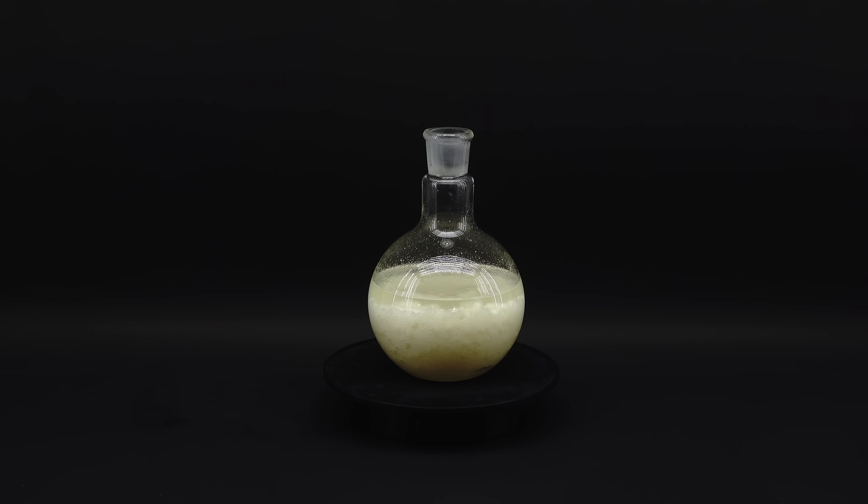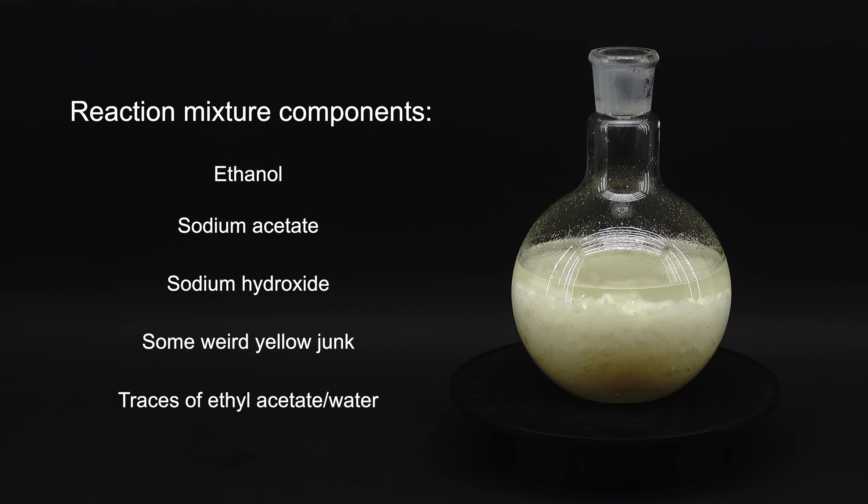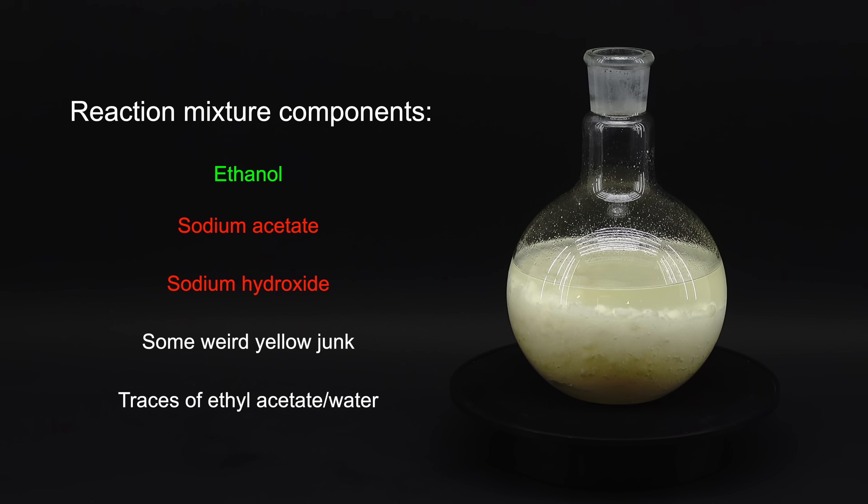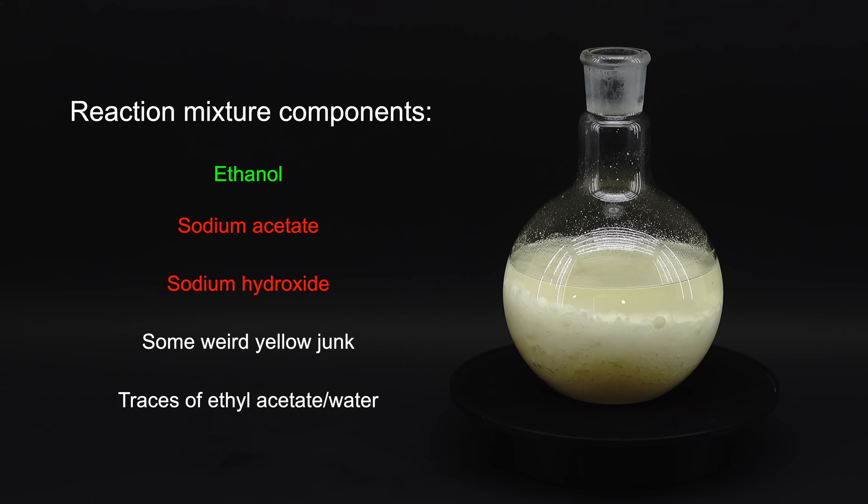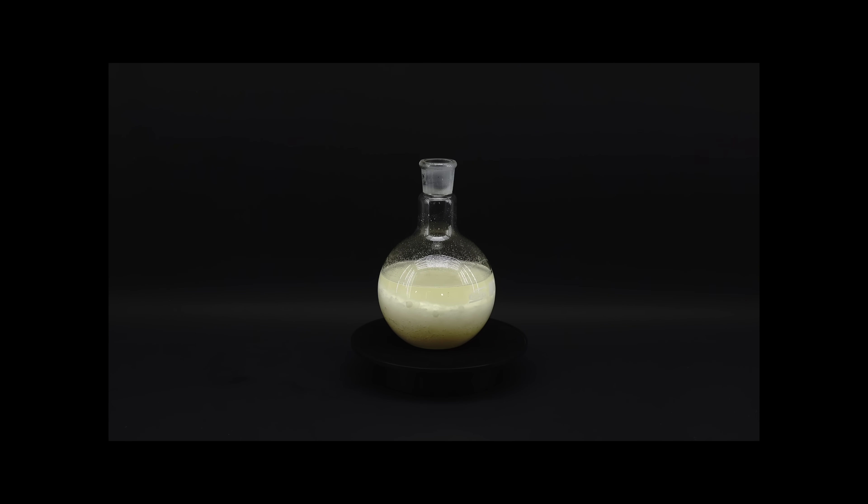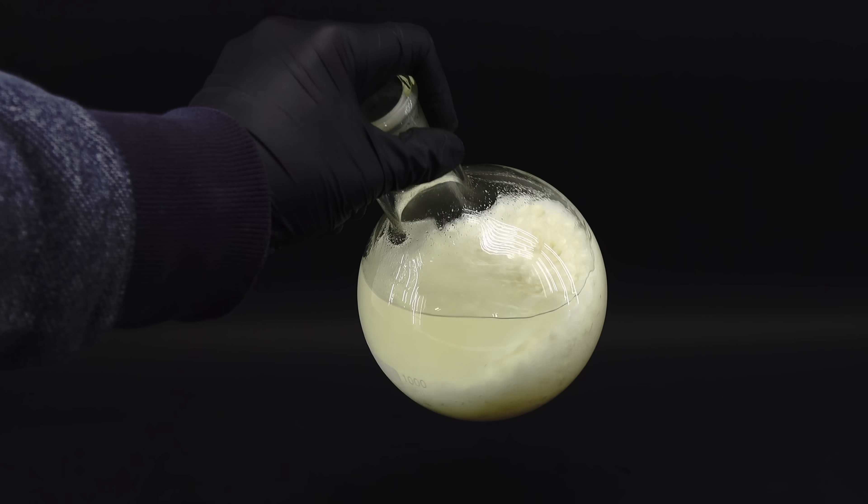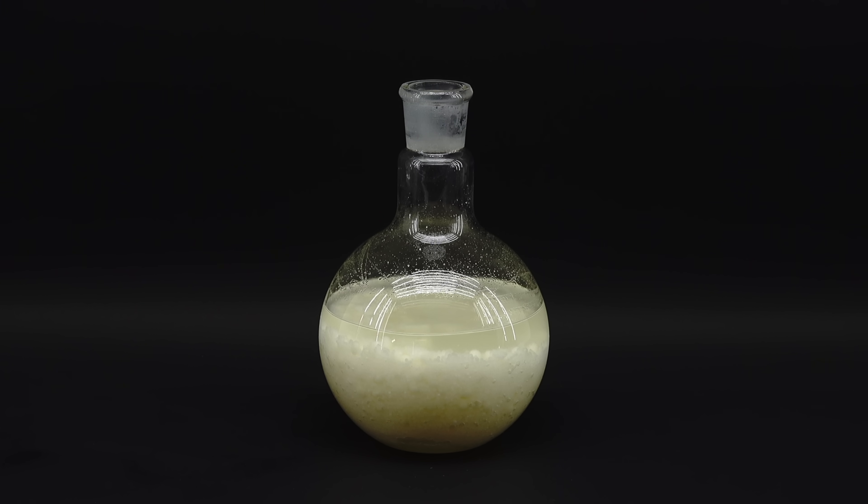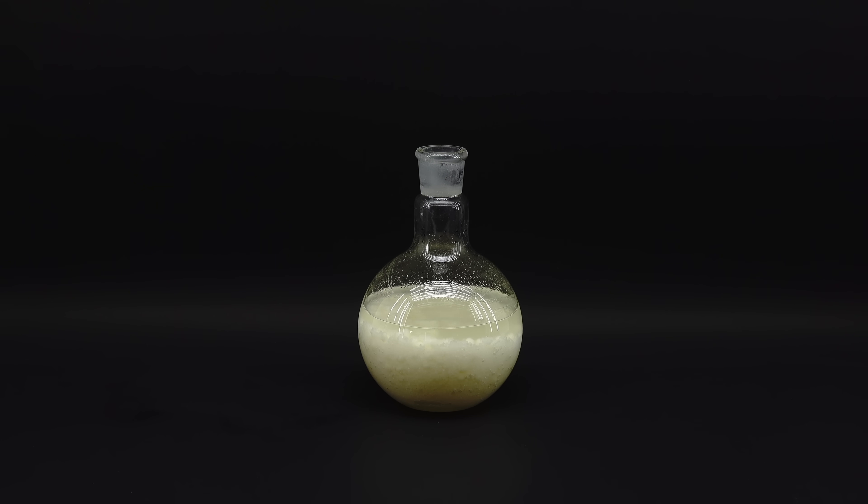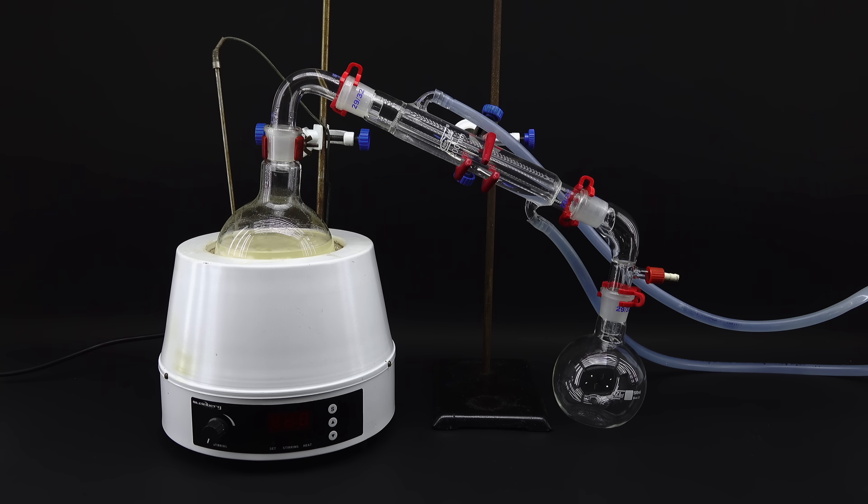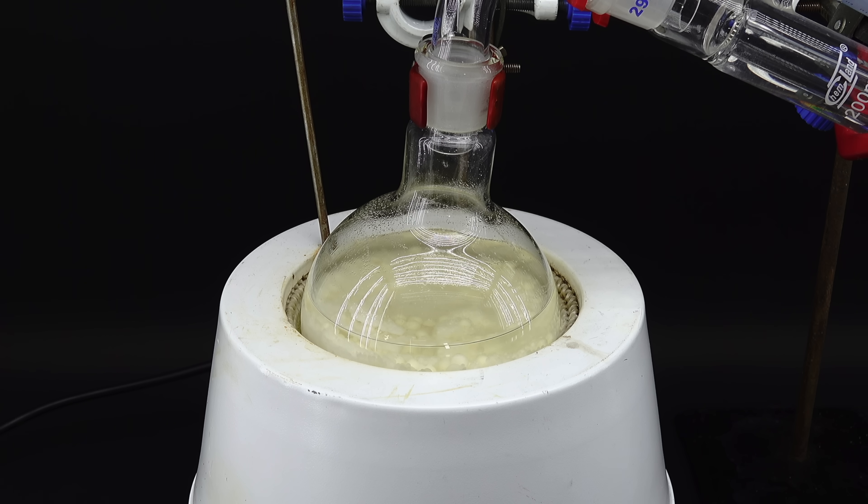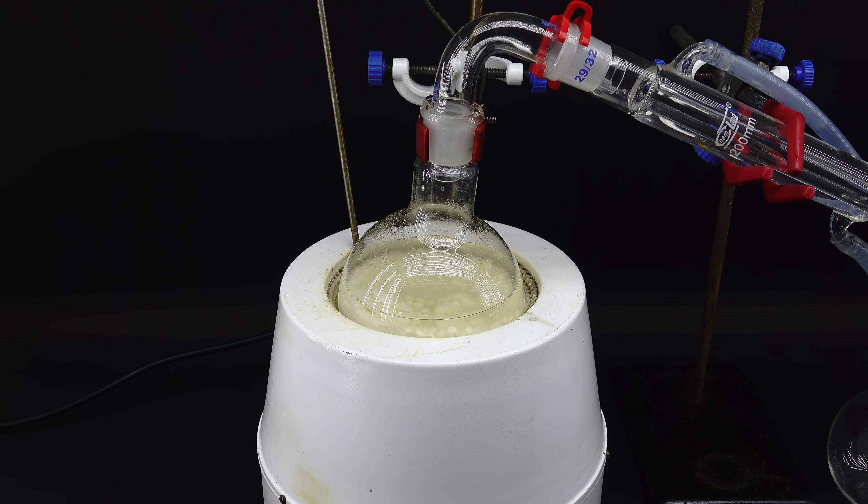Now, to make some fine chemistry vodka, I need to selectively pull the alcohol from the sodium acetate and unreacted sodium hydroxide, because drinking drain cleaner isn't exactly what I envisioned for this project. Since the alcohol is a liquid and the junk I want to separate it from is solid, the logical thing to do is just boil the alcohol out of the flask. To take care of that, as well as collect the resulting vapors, I set my flask up for distillation, which brings this project one step closer to how vodka is actually made, and I think that's really cool.